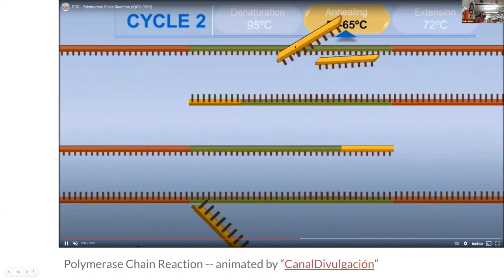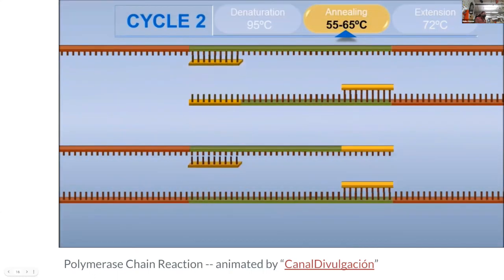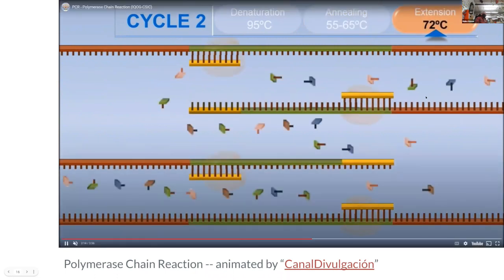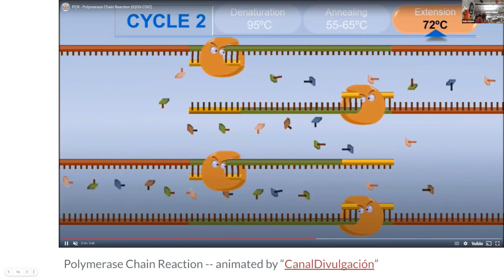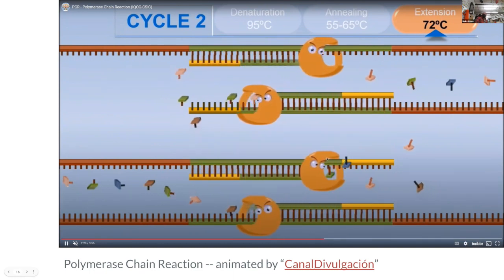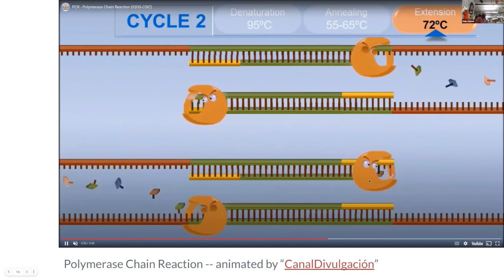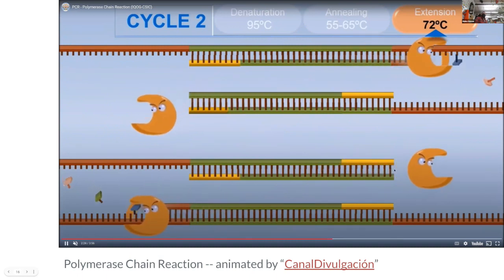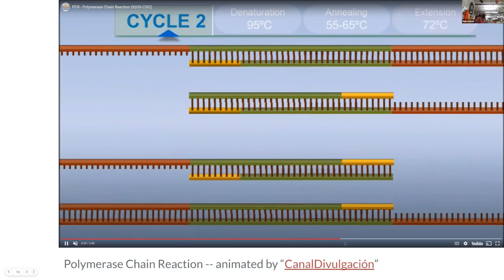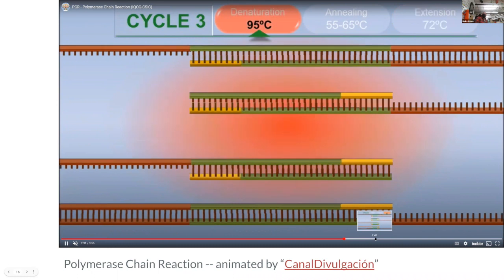So that's going to get copied and copied and copied until it overwhelms all the rest of the DNA that's there. And so there'll be some of this red that's copied, but you can see it's not all of it is copied. And once you get a couple rounds in, this is just going to be copying those green sections, and you'll have tons and tons of those green sections, and it'll very much overwhelm the rest of it. So you'll be able to see how much of this you have.